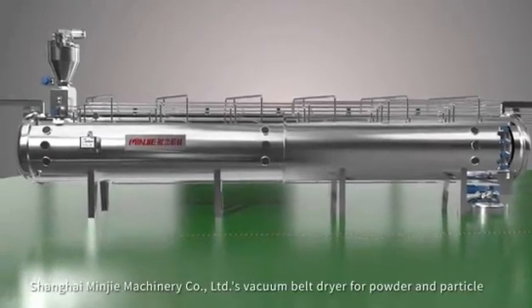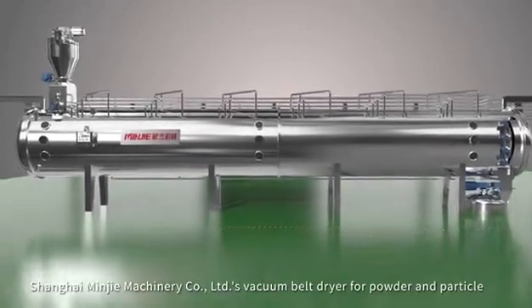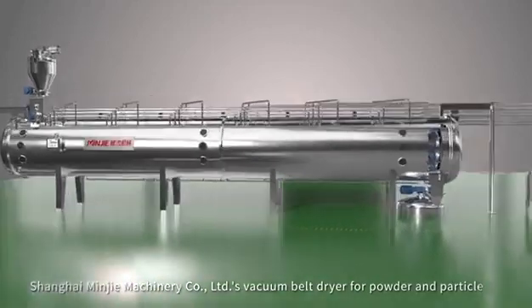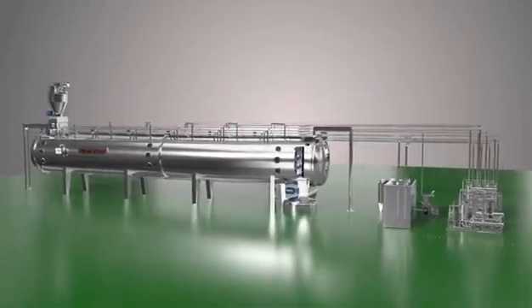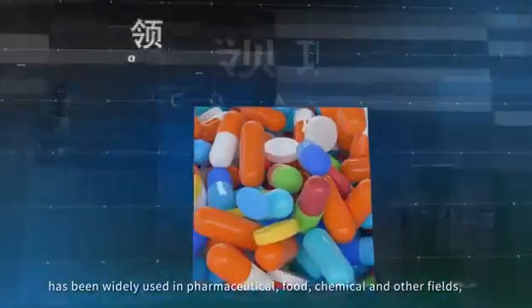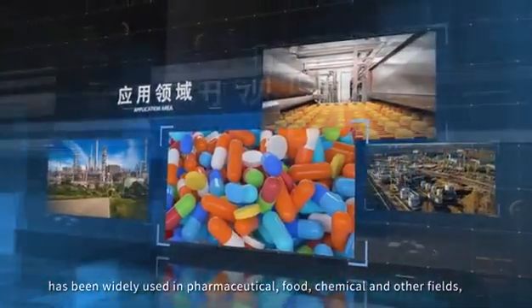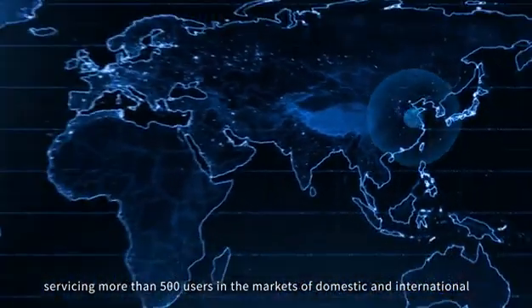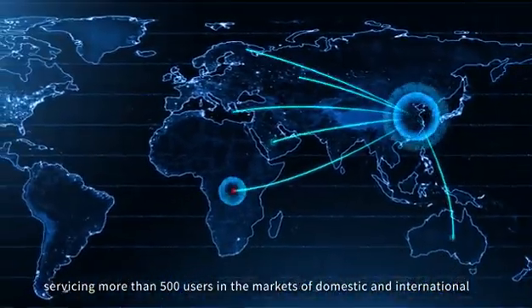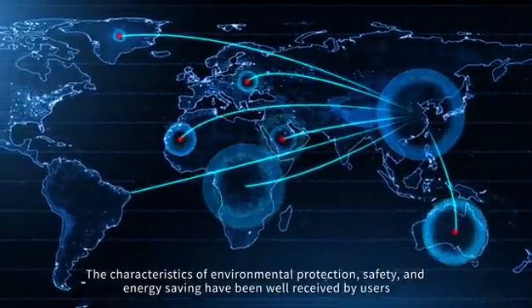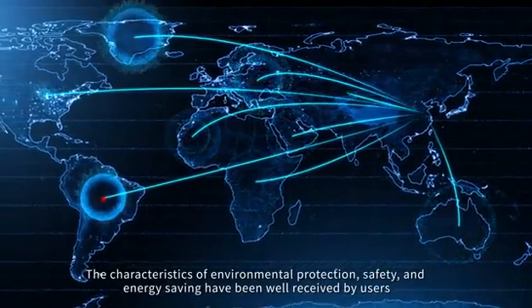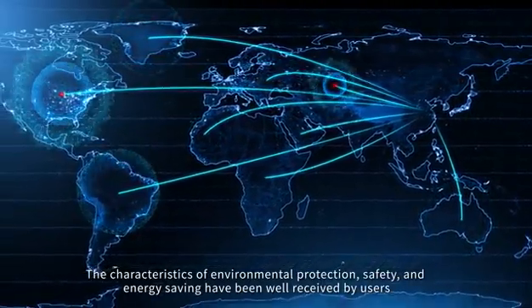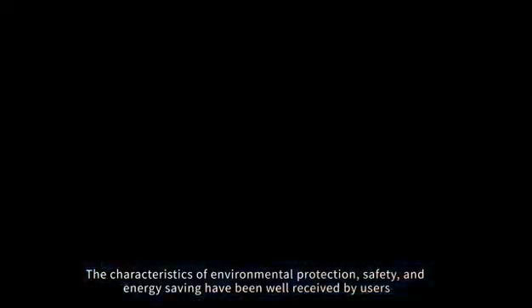Shanghai Minji Machinery Co. Limited's vacuum belt dryer for powder and particle has been widely used in pharmaceutical, food, chemical, and other fields, servicing more than 500 users in domestic and international markets. The characteristics of environmental protection, safety, and energy saving have been well received by users.